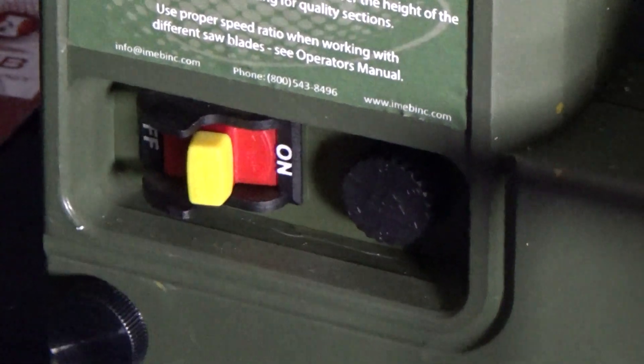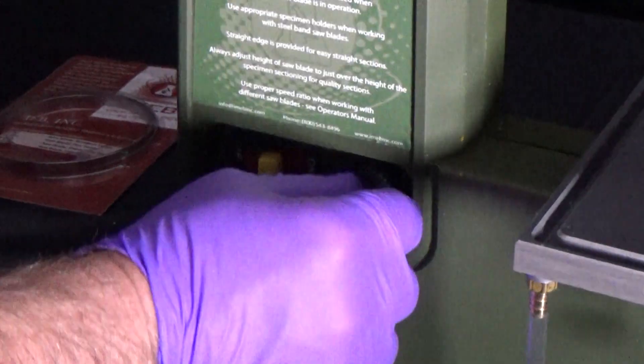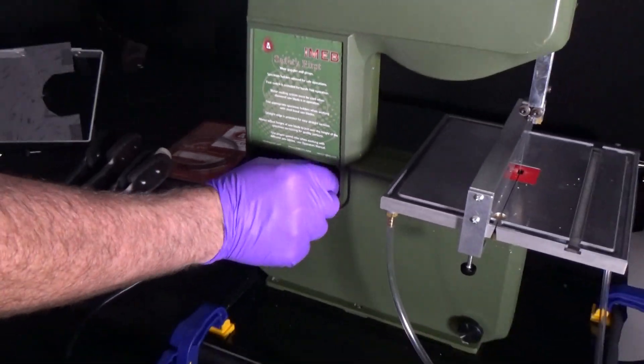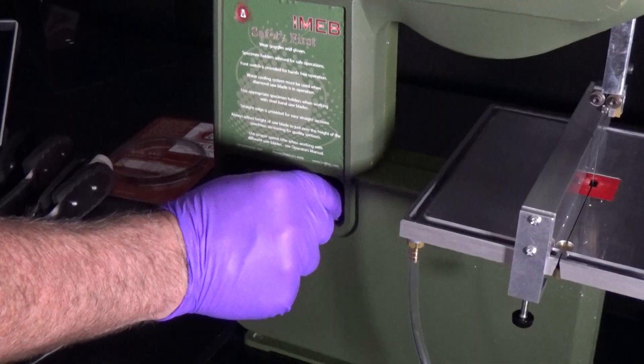To operate the bone bandsaw, flip the switch on. To control the speed, you can turn the knob higher or lower. The foot pedal that comes with the bone bandsaw can be used for hands-free operation.